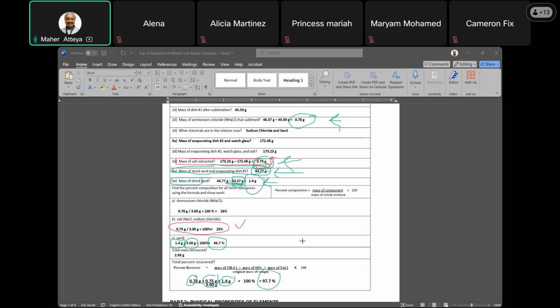This is excellent recovery. Correct, excellent recovery. And this is the ratio, about 25 to 47, something like this, or 46%. So, any question about the data here? Any question?